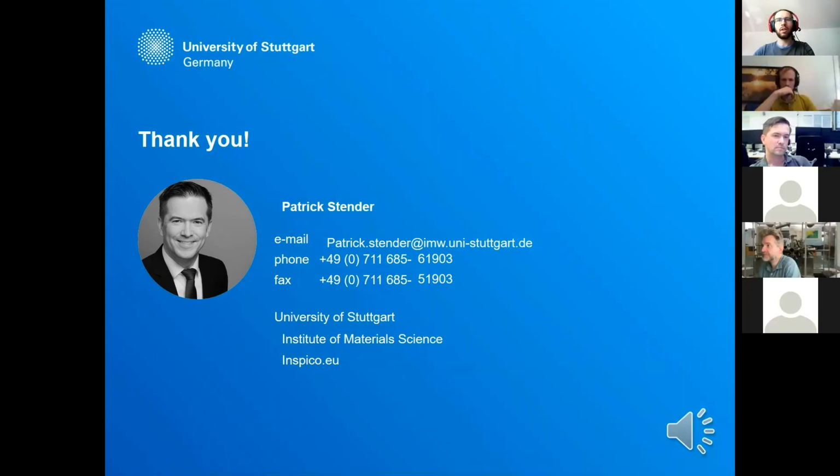A quick question. How interoperable is your software? Can we open up any raw data file and run it through the same software, or is it only for the raw format that you have from your atom probes?